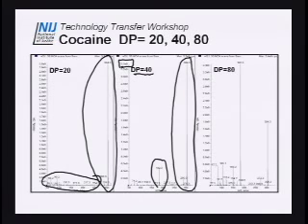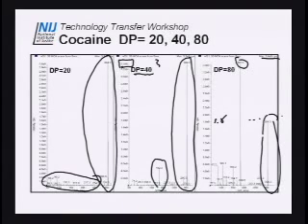The next one down here is a declustering potential of 80. You can see here's the 304 here. The highest mass here, it says 3.4 times 10 to the 9th. Well, that's higher than the previous one. Yeah, it's 182. I've actually cut 304 down to 1.8 relative to this 3.3. So I've actually now cost myself sensitivity in cocaine.